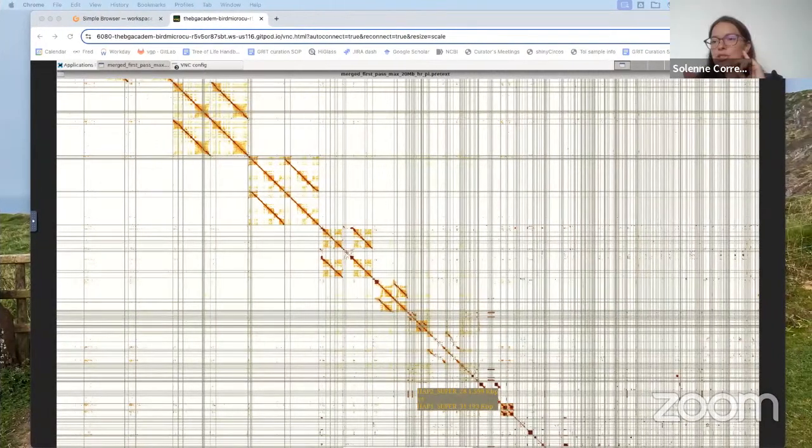I do have a first comment, saying that it's really impressive to be able to get that level of detail, because that's always something that's a bit weird when doing manual curation. I'm not sure if it's exactly what I see.